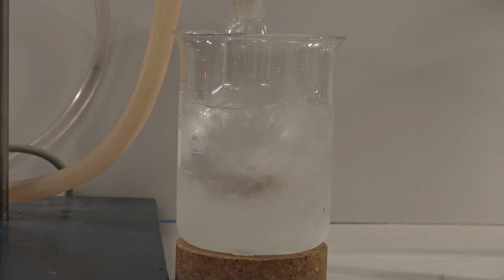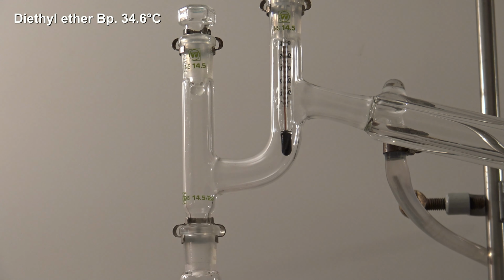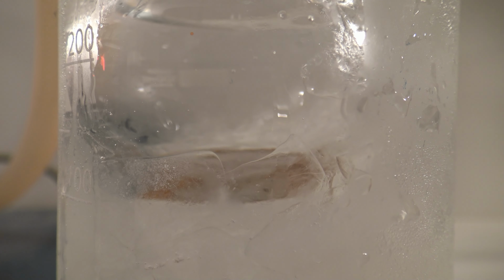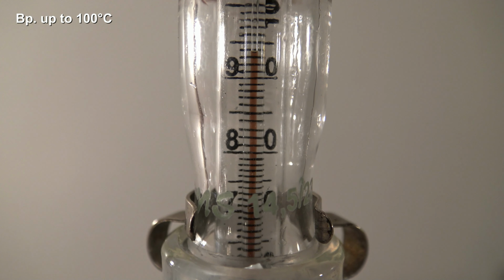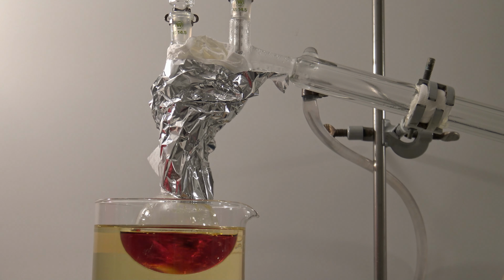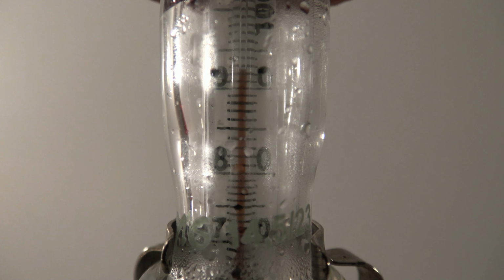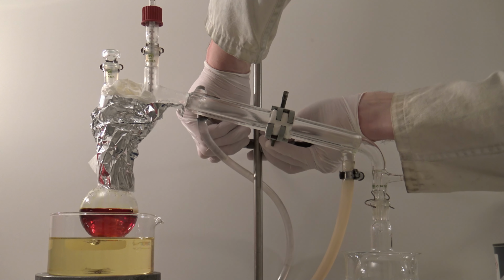The receiving flask was cooled with ice because diethyl ether was going to be distilled off first with a boiling point of 34.6 degrees C. Everything was distilled off that had its boiling point below 100 degrees C. In the meantime, the bridge was isolated. When the temperature dropped after 95 degrees C, while the oil bath's temperature increased, the distillation was stopped.